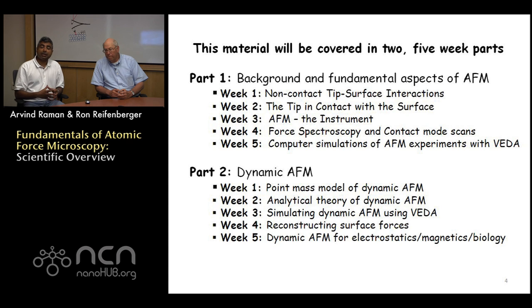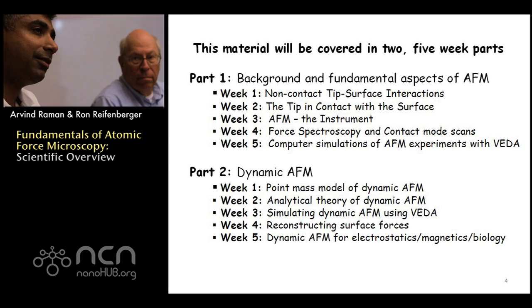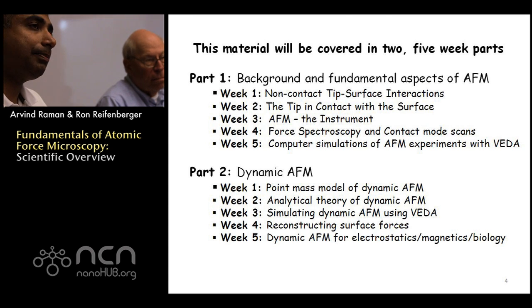And towards the end of the class, we will move on to speaking about electrostatic force microscopy. We'll touch on magnetic force microscopy, and importantly, we will actually look at aspects of dynamic AFM in liquids when applying it to biological samples, which is a pretty different area of application of dynamic AFM methods. And understanding dynamic AFM in the context of liquid environments is quite challenging and difficult, and will be covered in some depth in this class.